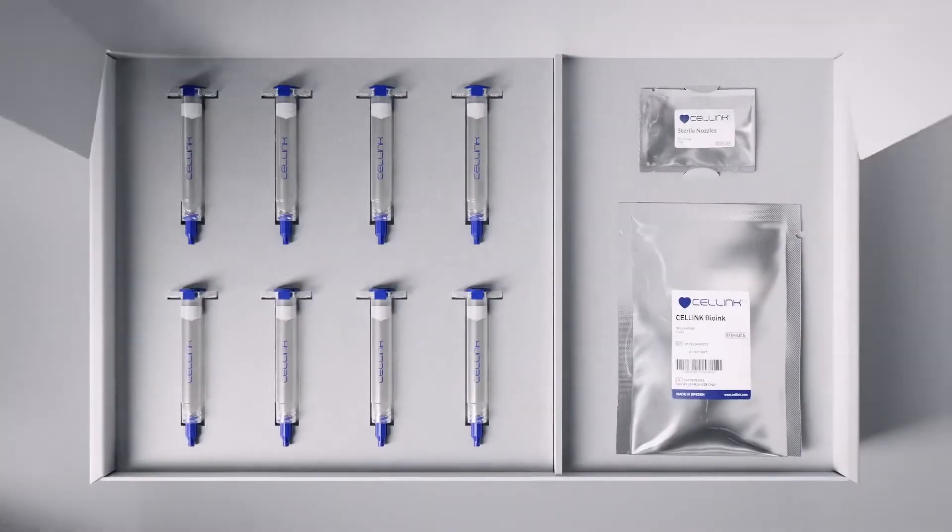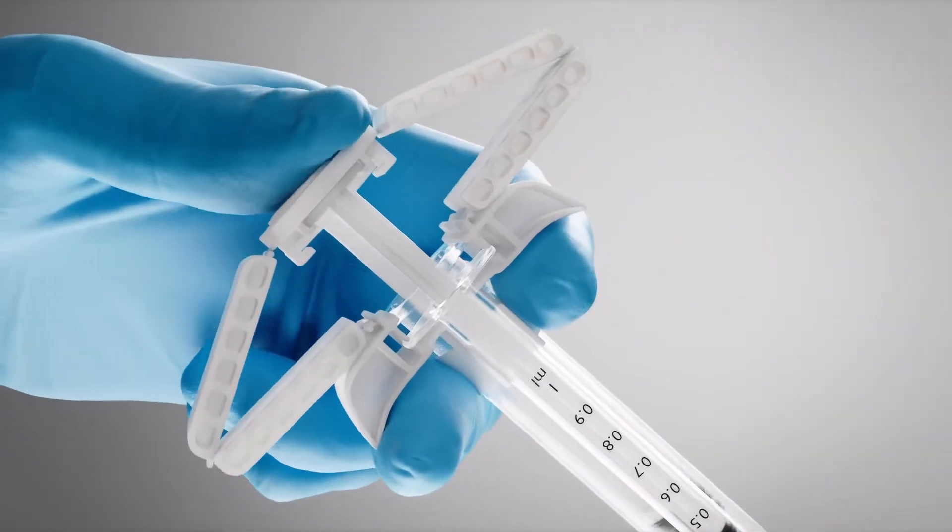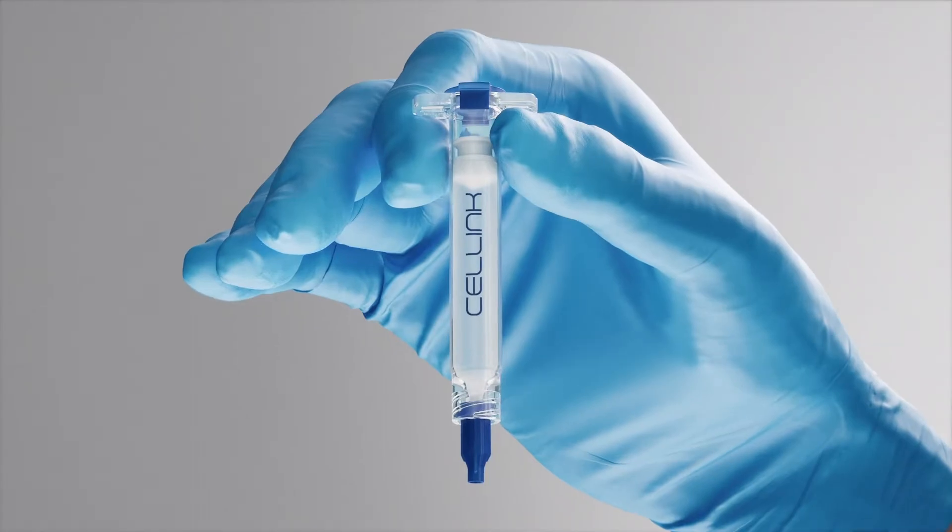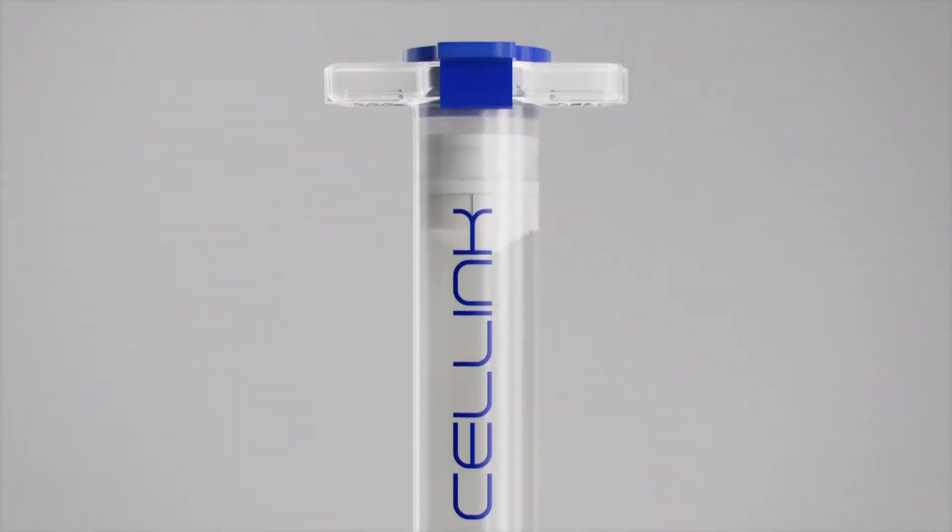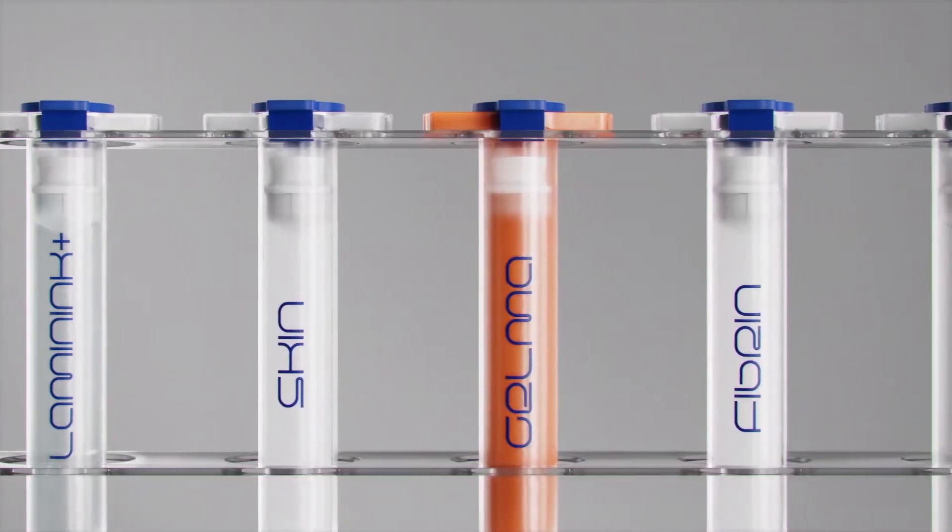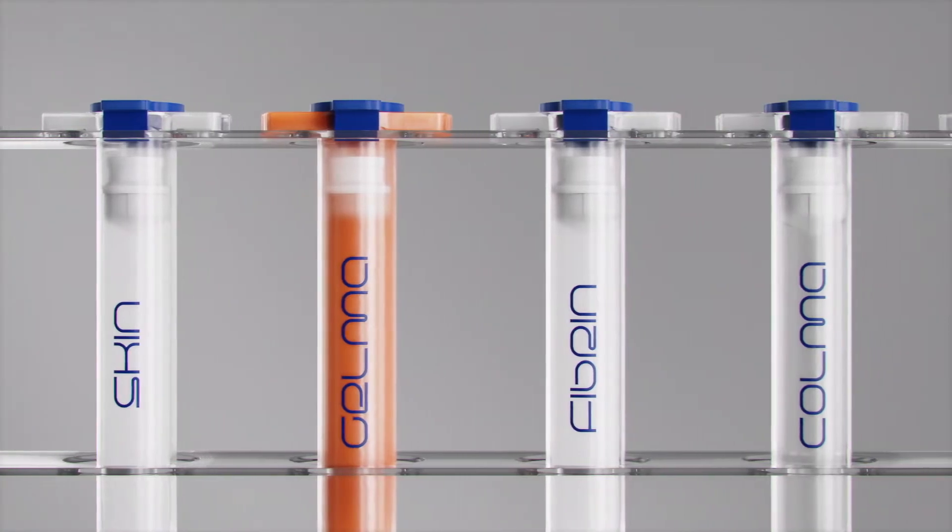At the core of this powerful technology are the CellLink Bio Inks, composed of millions of carefully sourced and tailored living cells suspended in an organic hydrogel. Different types of Bio Inks are customized to print a wide variety of tissue.